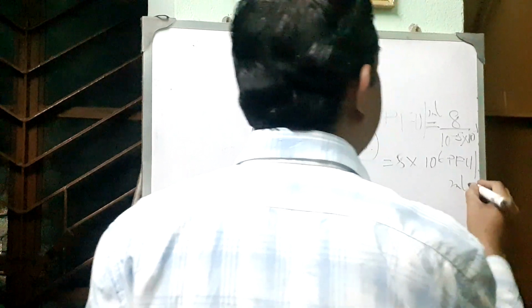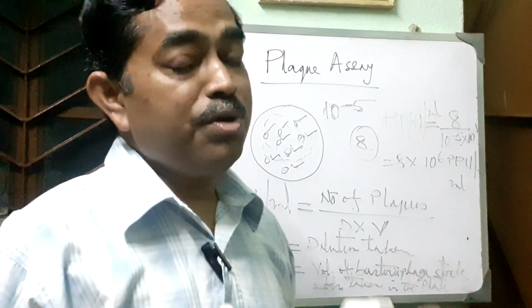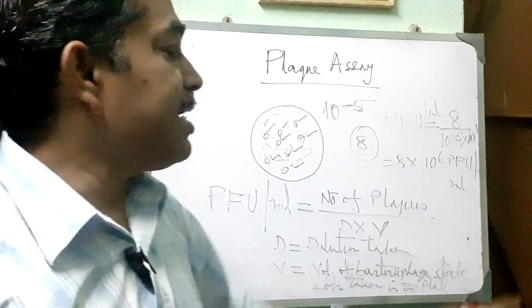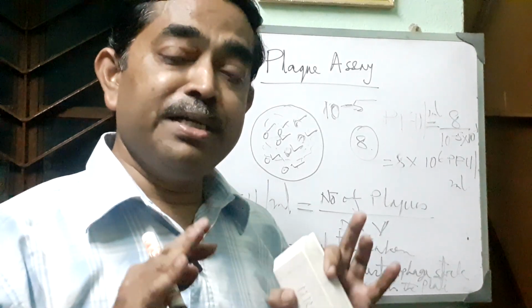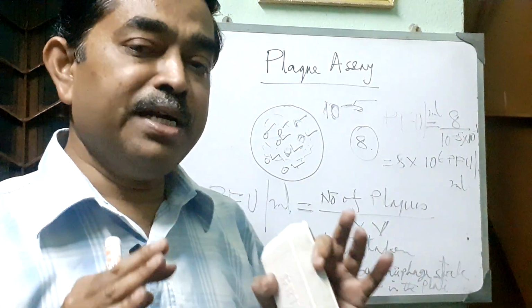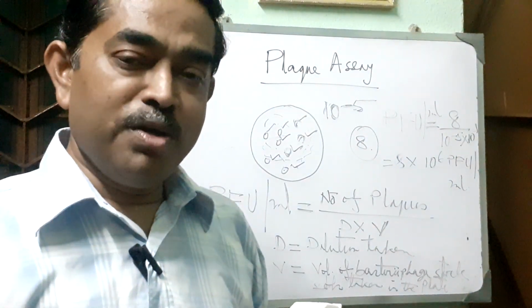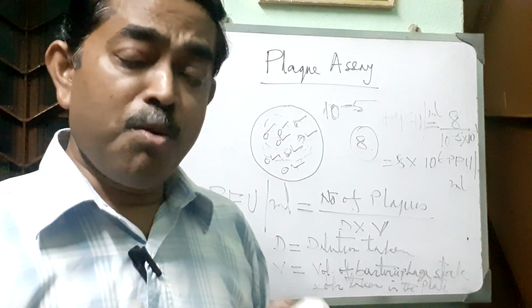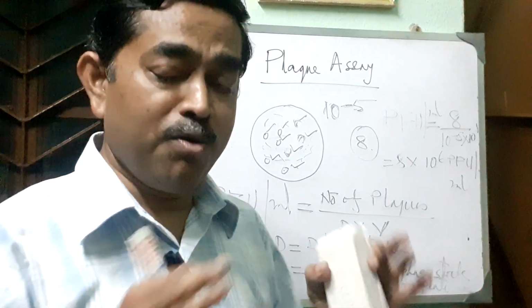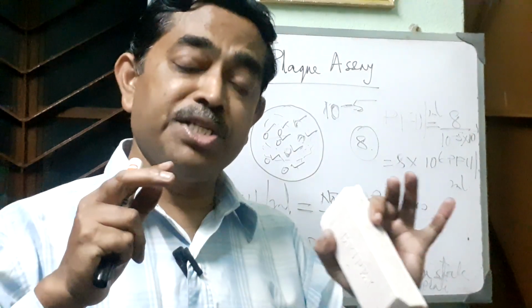So this is the measurement of the bacteriophage present in the sample, and whether it is present, we can also determine by this simple method, plaque assay. By this plaque assay we can confirm that the bacteriophage attack has been done. We can take the necessary steps for proper cleaning. We can also change the starter culture strain, and proper killing is the most important thing, by peracetic acid at 200 ppm. I have already discussed it. And chlorination can be done at a concentration of 600 ppm.